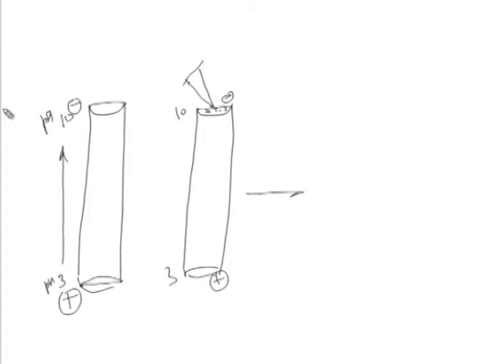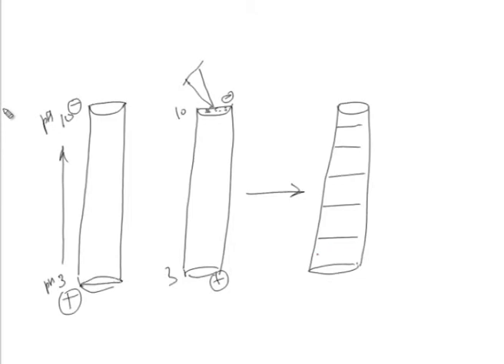So, when you apply the electric current, what you will get is different bands, which can be visualized by staining. The same will happen in a slab gel, for example, I can just show you here.